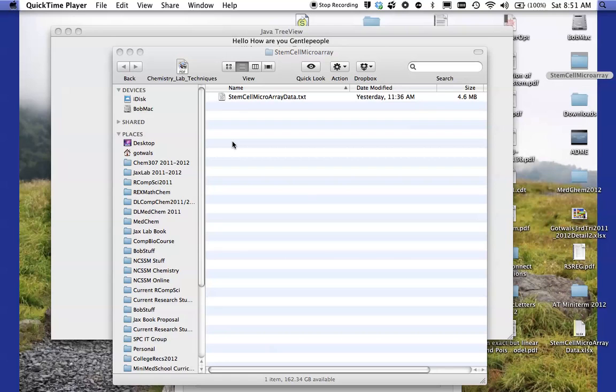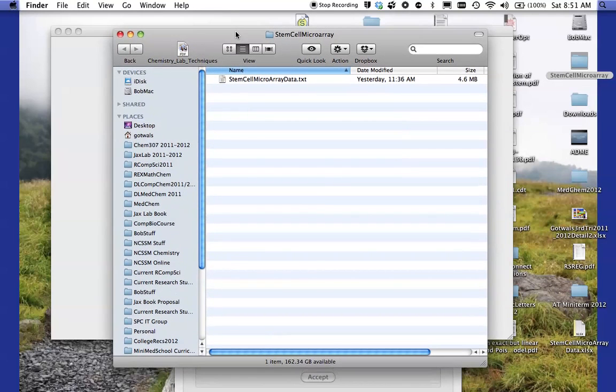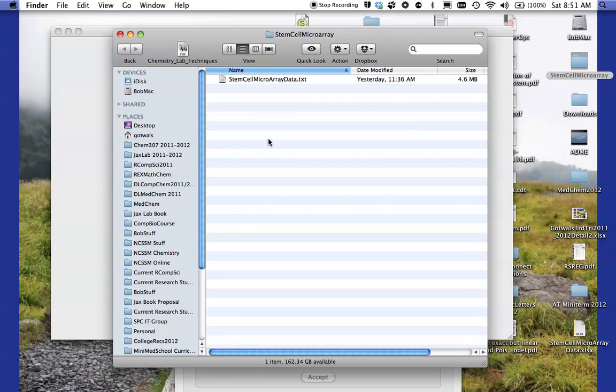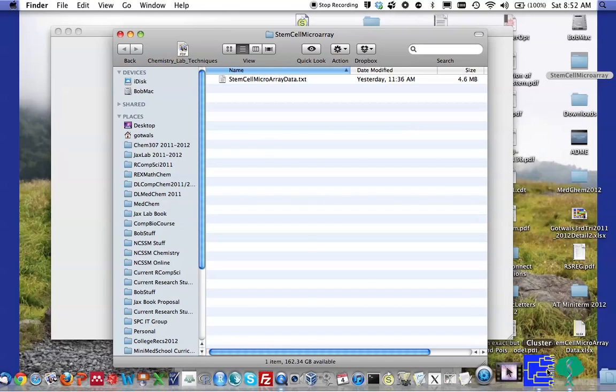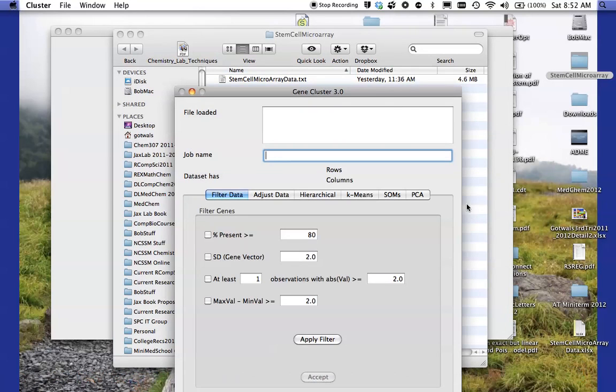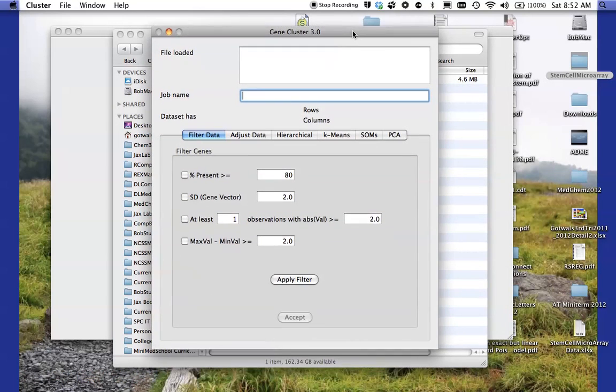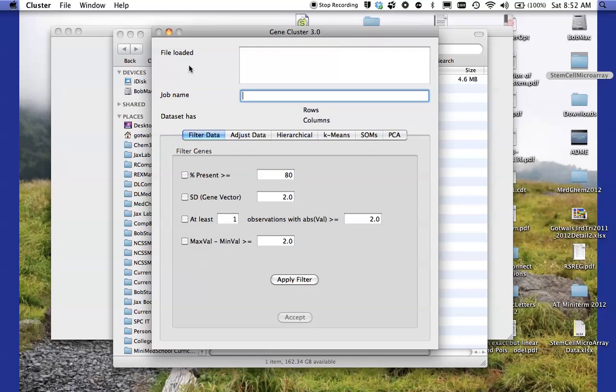What you see here on the screen is that I have created a folder on my desktop called stem cell microarray and in that folder there is a text file called stem cell microarray data and I obtained this off the web. The first thing I'm going to do is use the cluster program to open up this file and to do some filtering of the data.